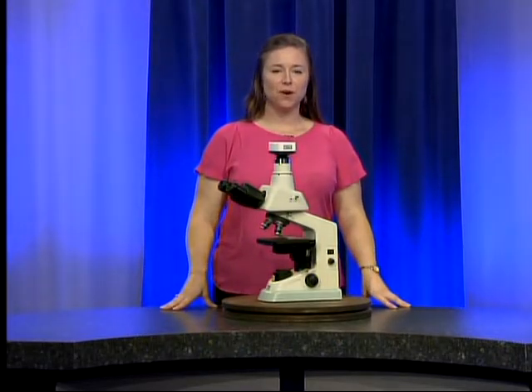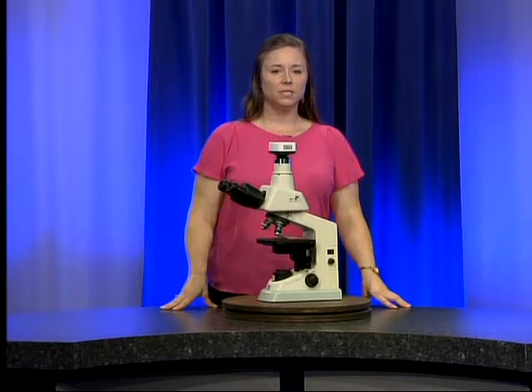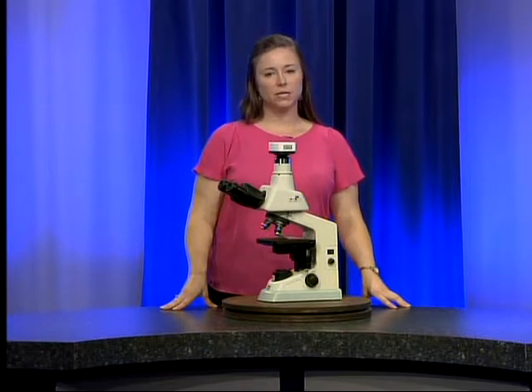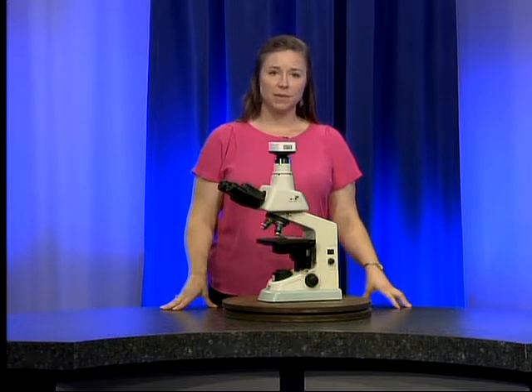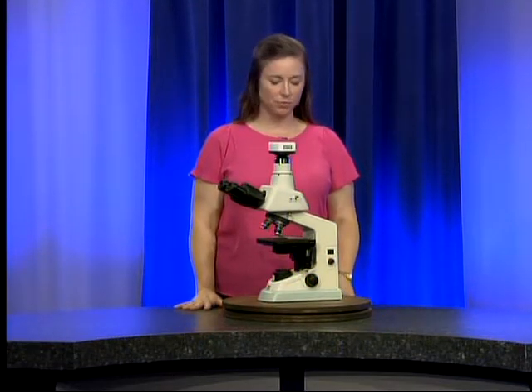Welcome to video 204 of the County Health Department Nikon Eclipse E100 microscope introduction series. This video is going to cover the daily use of the Nikon Eclipse E100. I'm Ashley Megalan, a technical consultant for the Alabama County Health Department laboratory system.